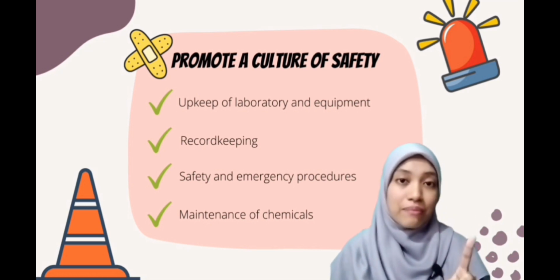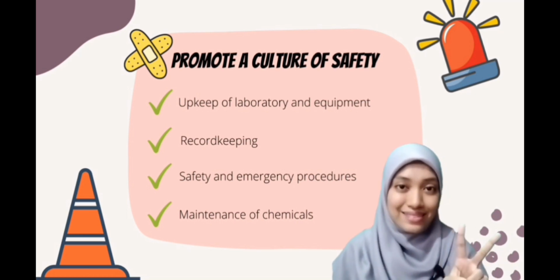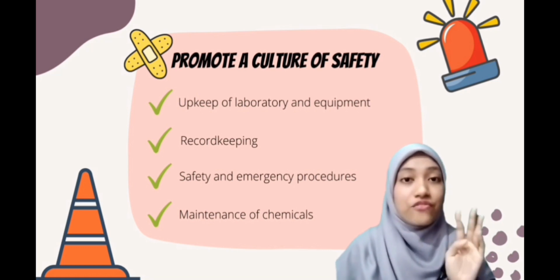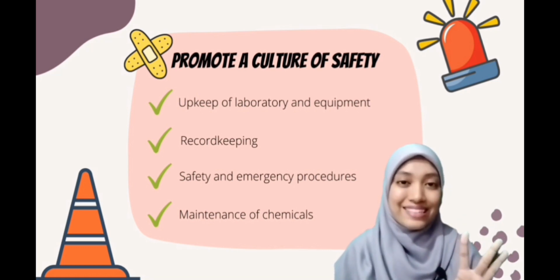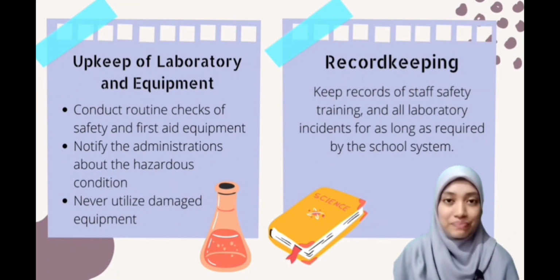Firstly, upkeep of laboratory and equipment. Second, record keeping. Third, safety and emergency procedures. And fourth, maintenance of chemicals. Number 1, upkeep of laboratory and equipment.